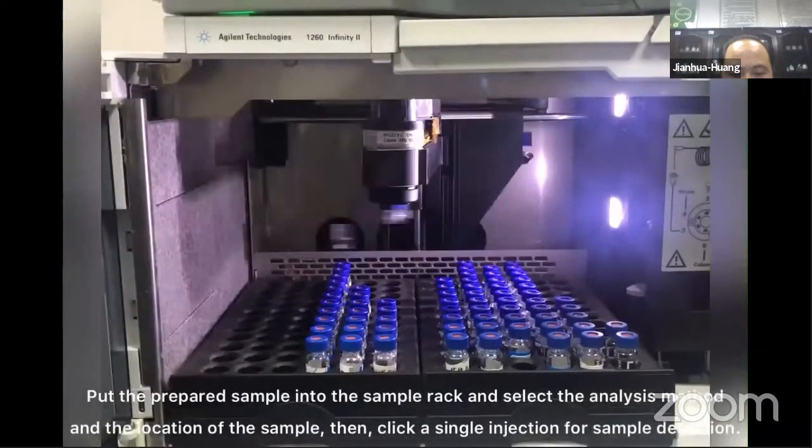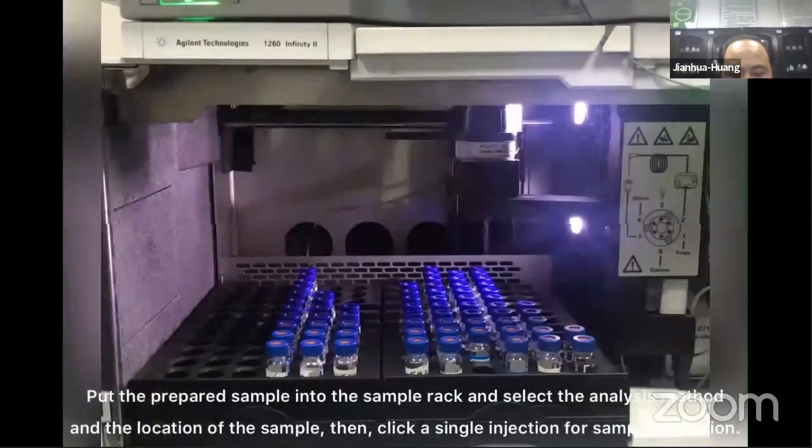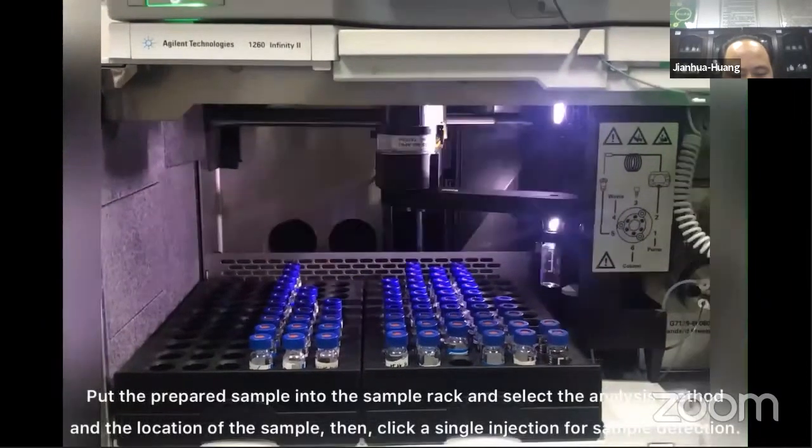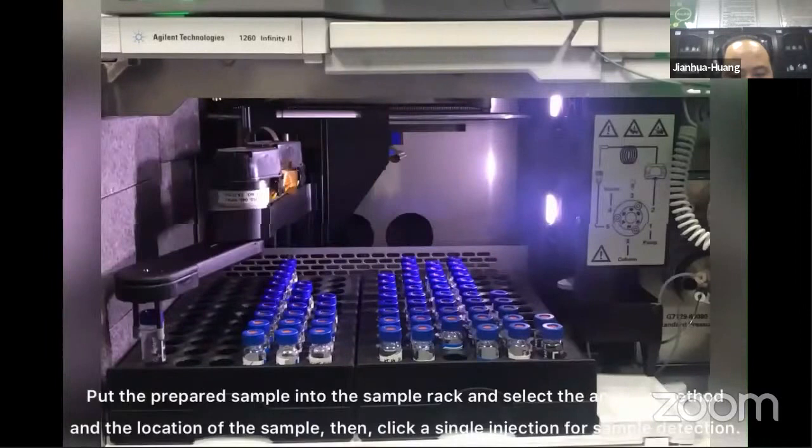Put the prepared sample into the sample rack and select the analysis method and the location of the sample, then click the single injection for sample detection.